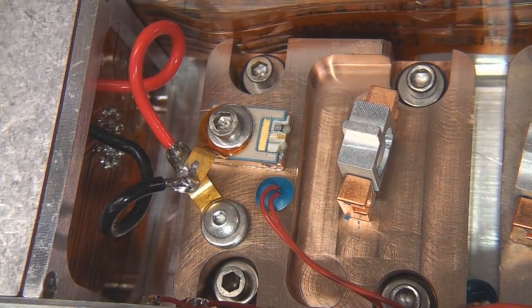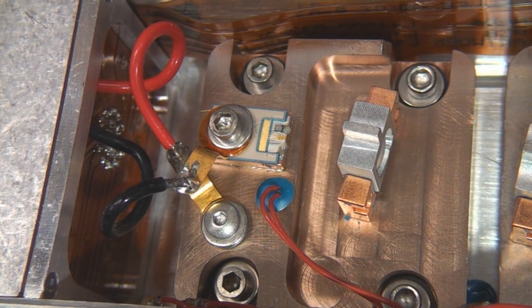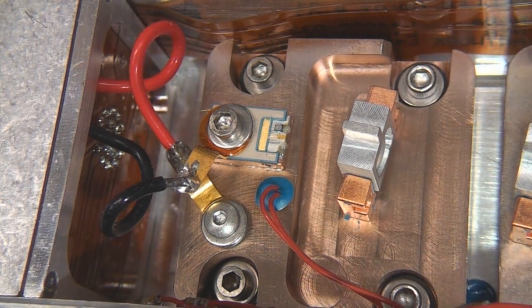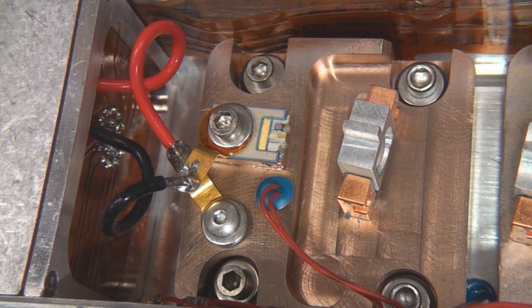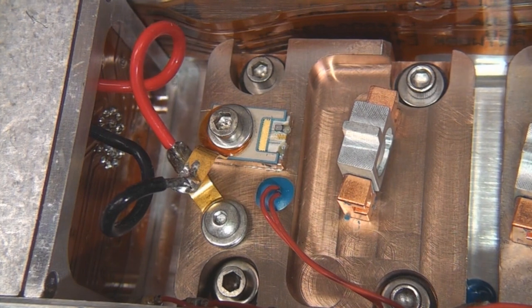Now obviously these things aren't too difficult to get something happening by just putting some current through the laser diode, but when I was trying to probe out the pin connection to this cable, I noticed that across the laser diode was measuring a dead short. I thought, oh, maybe we've got a dead laser diode there. But I can't see any visible damage, and these things are fairly well protected, so it seemed a little bit unlikely that it would be a completely dead short.